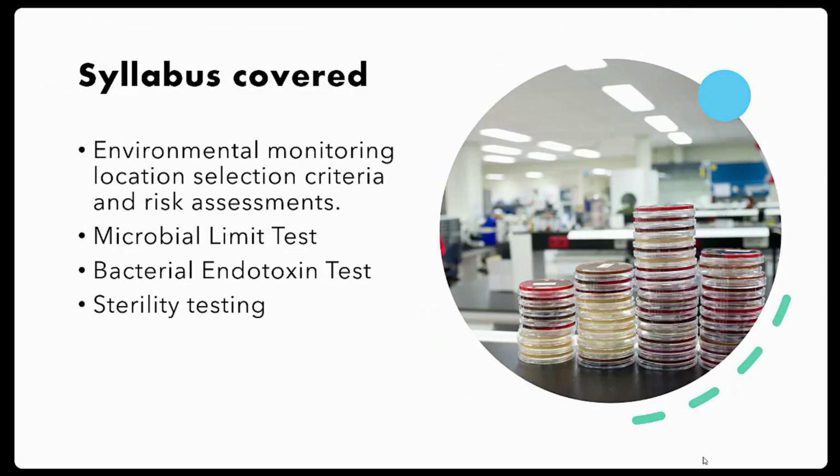Next, microbial limit test. This limit test will check water samples, API samples, and finished samples, whether the sample meets the predefined specifications for total aerobic microbial count, total combined yeast and mold count, and test for specified microorganisms. These are E. coli, Salmonella, Staph aureus, Pseudomonas, Enterobacteria, Clostridia, and Candida.